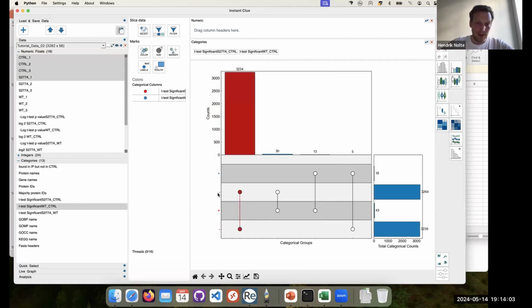At some point, this gets very messy, but I want to show you just one example, because as I told you, we are very interested in mitochondrial proteins. What we want to use in this case is we want to take advantage of the so-called gene ontology annotations. And I hope many of you have heard of them already.